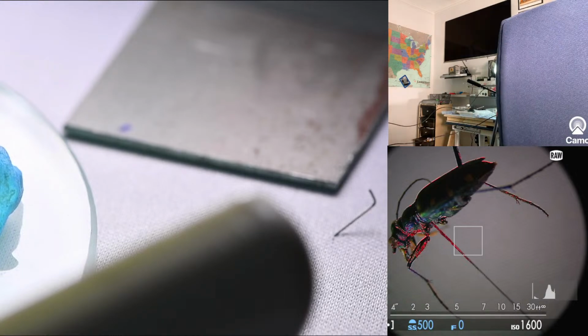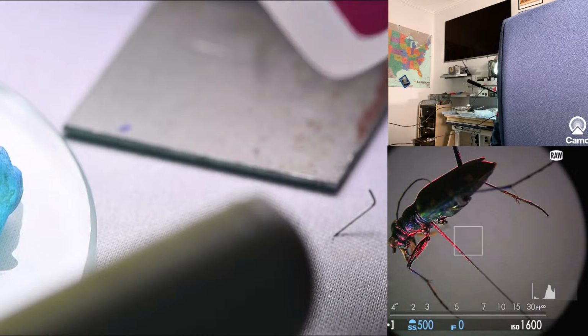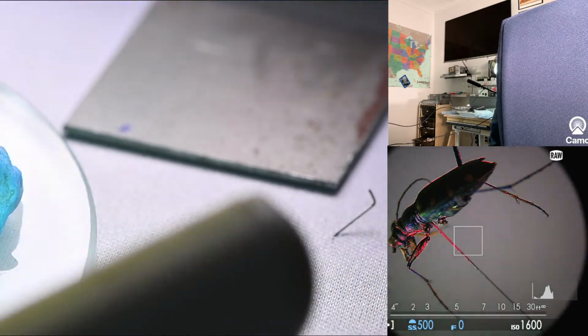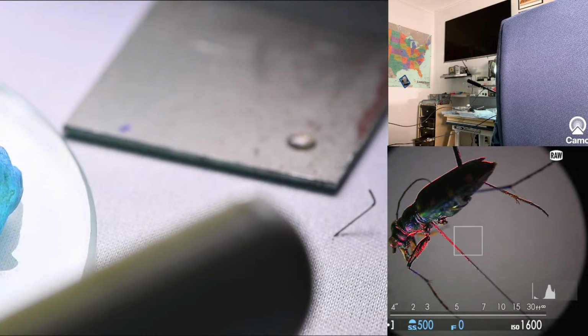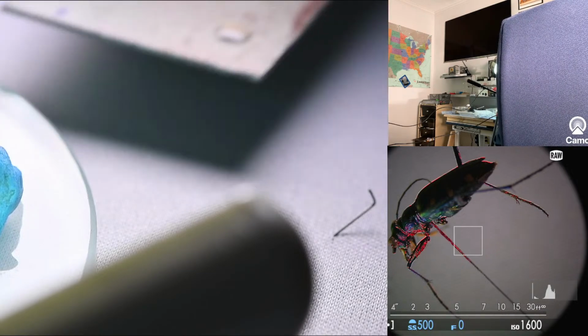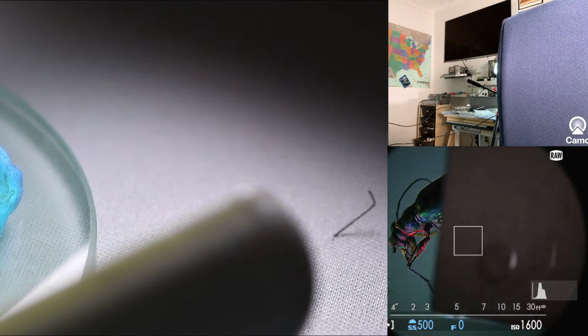Okay, good. So take your glue. Now, I do not use the runny glue for this. I use runny glue a lot for intricate stuff. But in this case, I use the cheap old regular super glue. And I put one teeny tiny minuscule partial drop right next to the pin, like so. That right there is way more glue than you will be using. Let me see if I can show it to you under the microscope so you can see how small the blob is. Well, it actually looks quite big under the microscope.